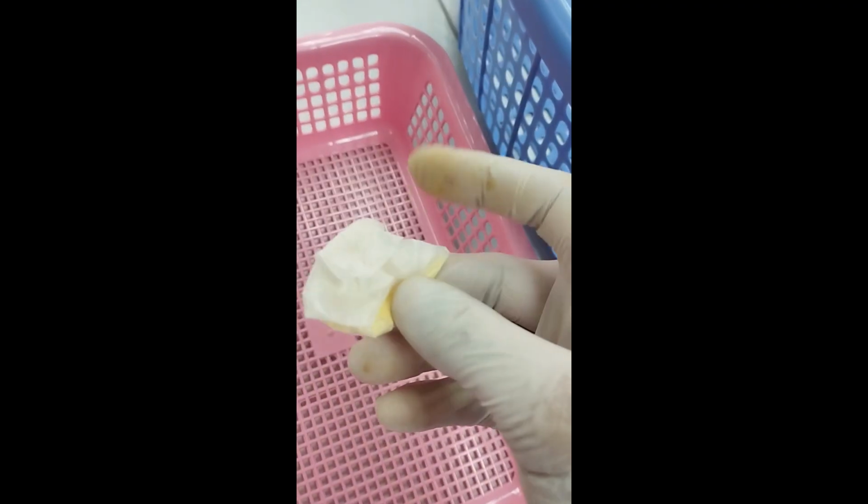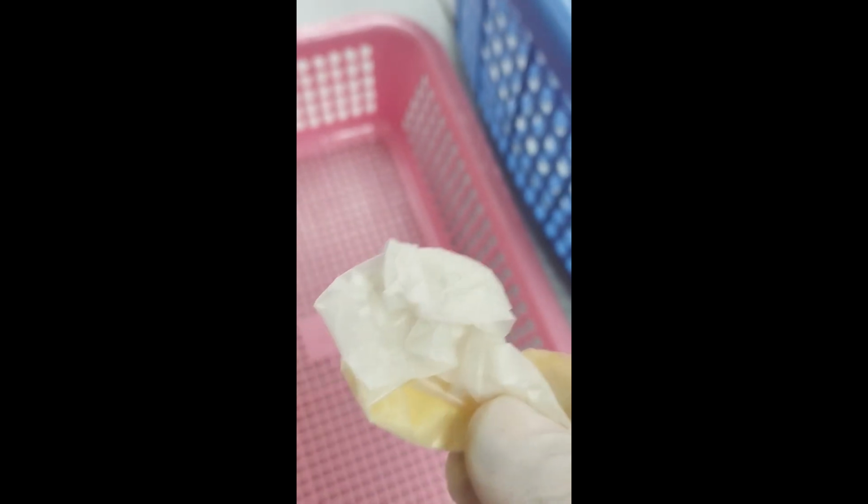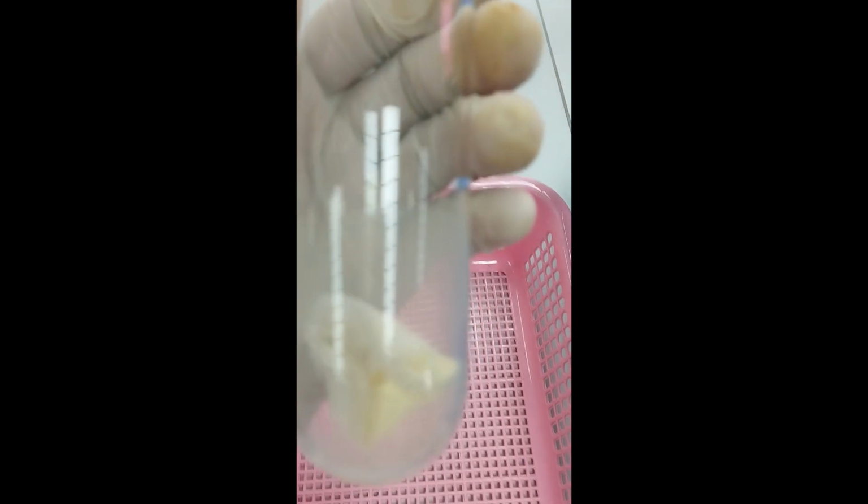Now you see I have folded this package like this. This is on weighing paper, and this is the digestion tube. Now I'm going to put my sample into the digestion tube like this. Now you see my sample is in the digestion tube, and now I have to put in the potassium sulfate and copper sulfate powder and 15 ml of sulfuric acid, and later I will show you how it will look after addition of these.